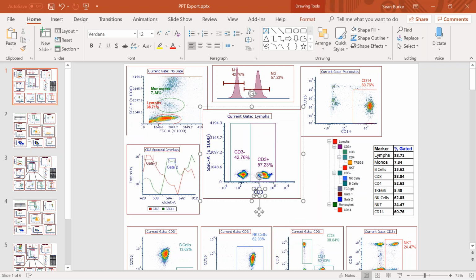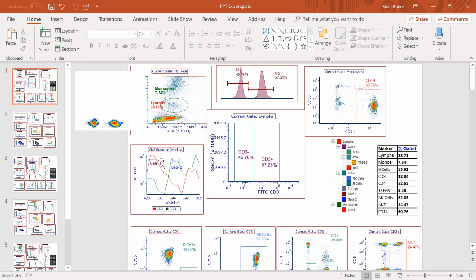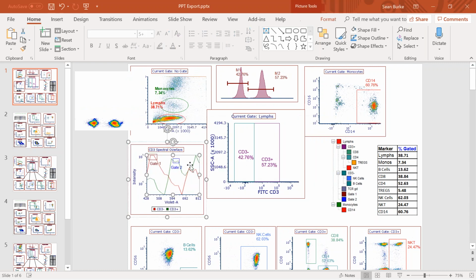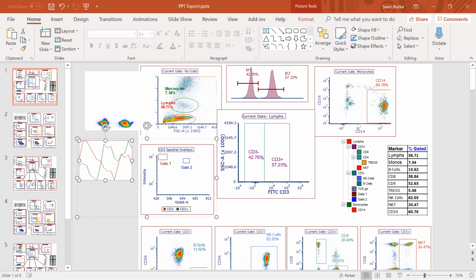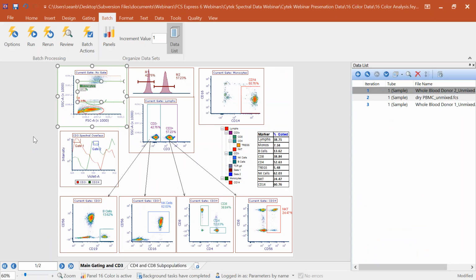And if you wanted to change your axis label, which you could do very easily in FCS Express, say you wanted to change it to FITC CD3 here, you can change it. If you needed to grab something in, like the distribution of this data as part of your presentation, you can grab that. If all you wanted to do was come in here and grab these spectral lines as part of your presentation, right? You can pull these things out, and it really facilitates getting to a publication-ready figure, some sort of PowerPoint presentation for your lab, reports and things like that very easily.